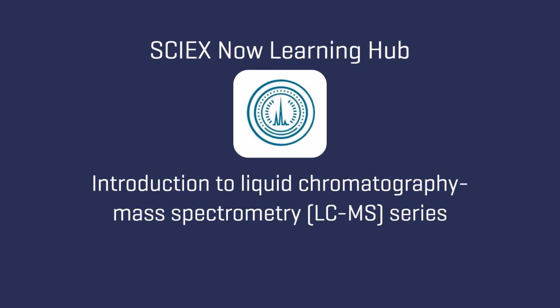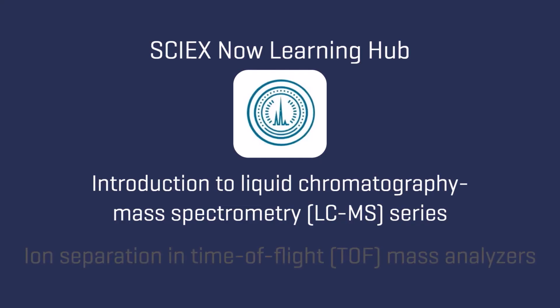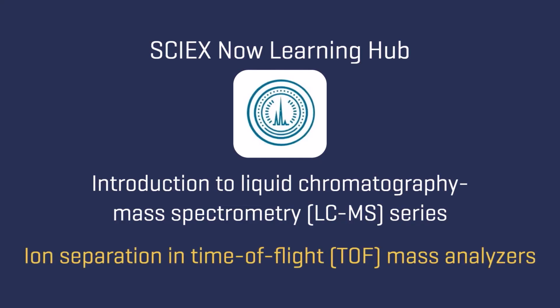Welcome to this episode of the SCIEX Now Learning Hub, Introduction to LC-MS series. In this episode, we will talk about how ions are separated in time-of-flight mass analyzers.